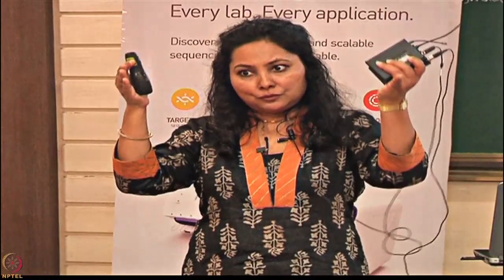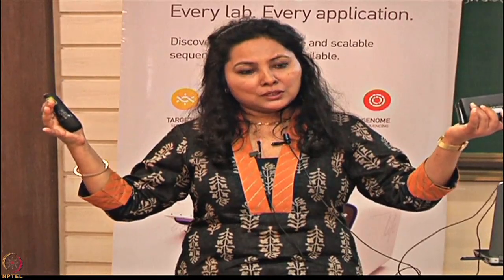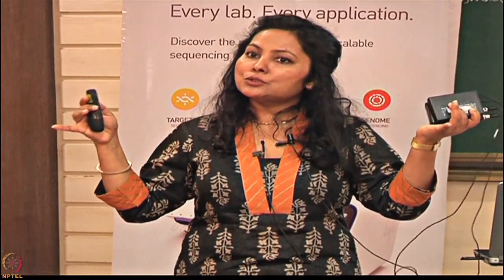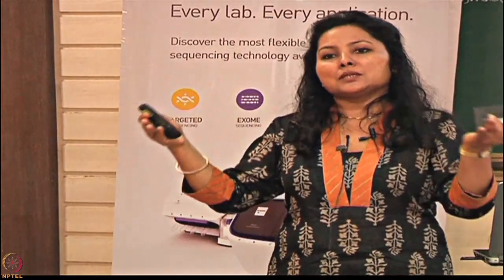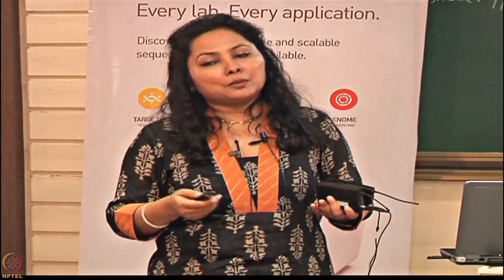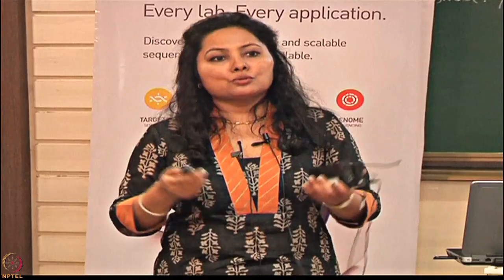So you have your fragment of interest in between, you link the adapters at both the ends, so that these adapter sequences are known, because these are coming from a chemistry, and then the primer comes and sits on these adapters, so that you can sequence this region in between. So with library preparation, you are enriching your region of interest and ligating these fragments to adapters.